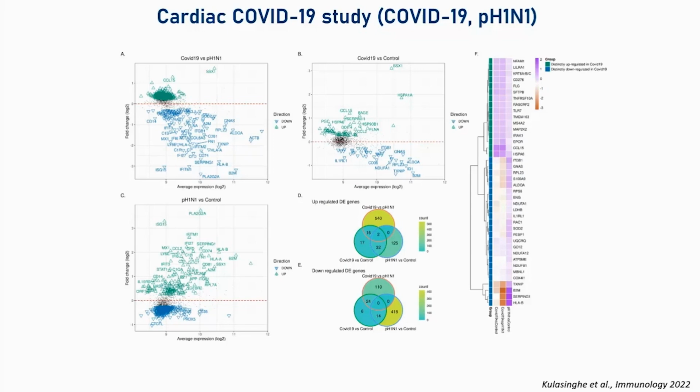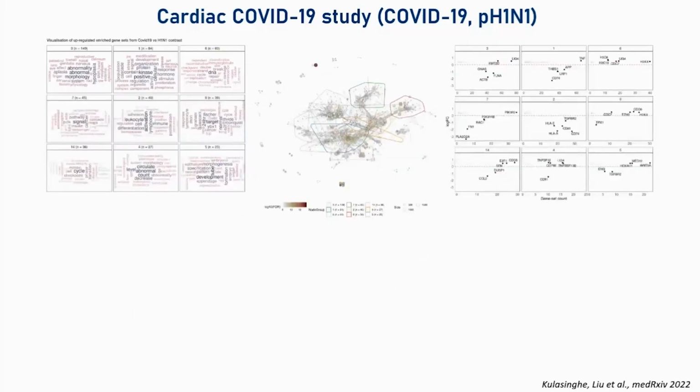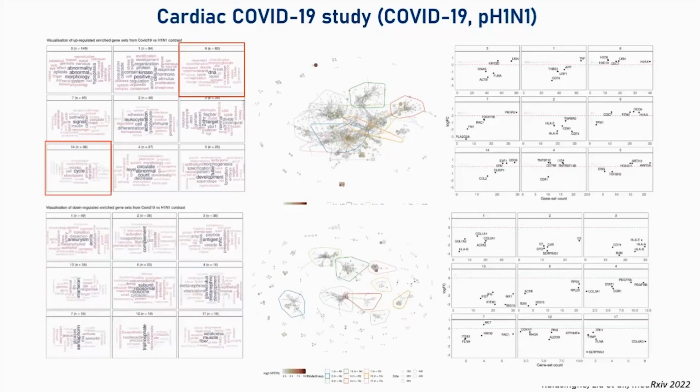And what we could see specifically, if I go to the volcano plots, so this is not taking your GO enrichment terms and plotting them, we could see that DNA damage and cell cycle type pathways were enriched in COVID-19. So they were upregulated in COVID-19 versus flu. Whereas when you looked at flu, the pathways that were upregulated compared to COVID-19 were your interferon and your complement pathways. So severe COVID-19, when we compare it to flu, looks quite different.